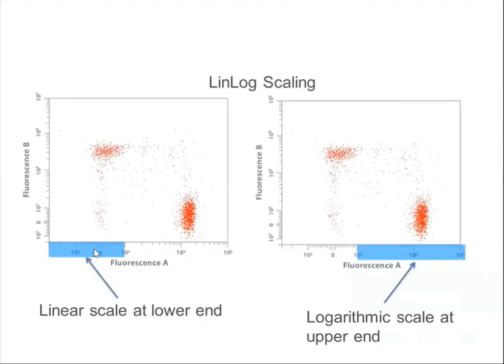Okay, so see here. Now you find this area is a linear scale, and this area is a logarithmic scale. That is called, the other name is lin-log scale.